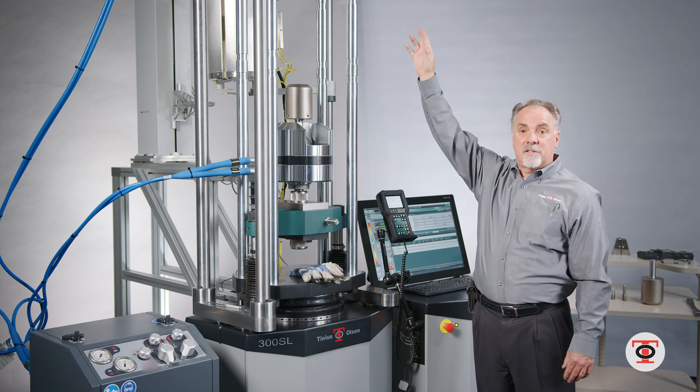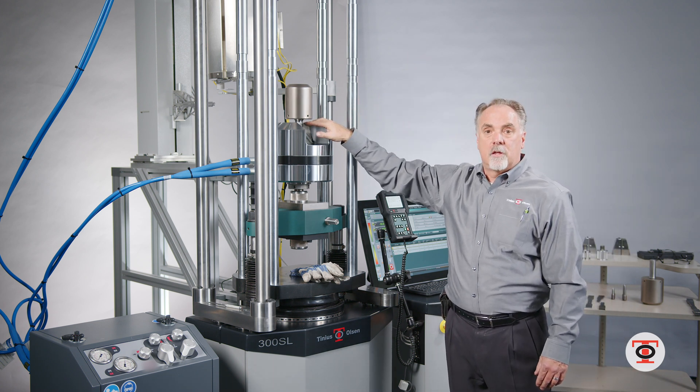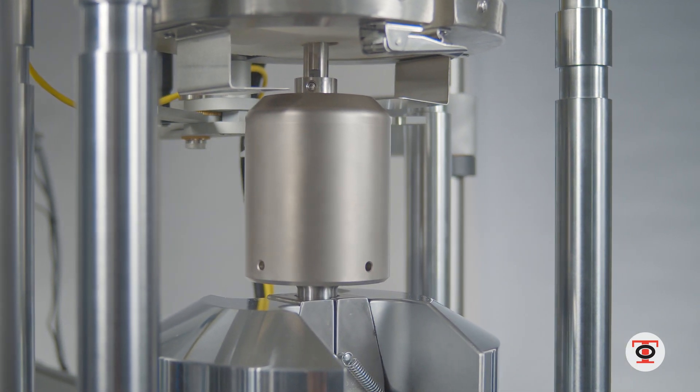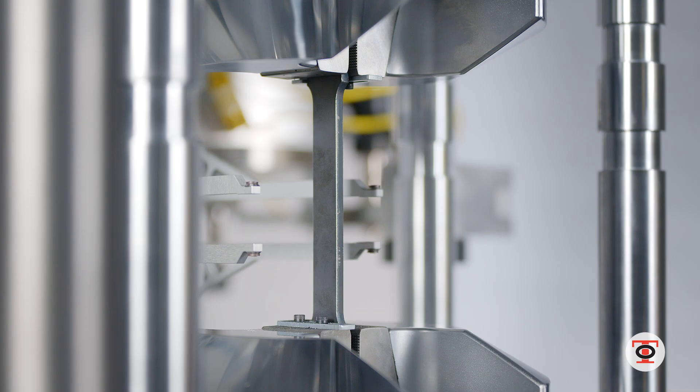The crosshead is in the utmost position here. We have sacrificial studs that we use so you can change out your tooling to do a high temperature test, a room temperature test, or if you're doing flats it'll do the flats at room temperature as well.